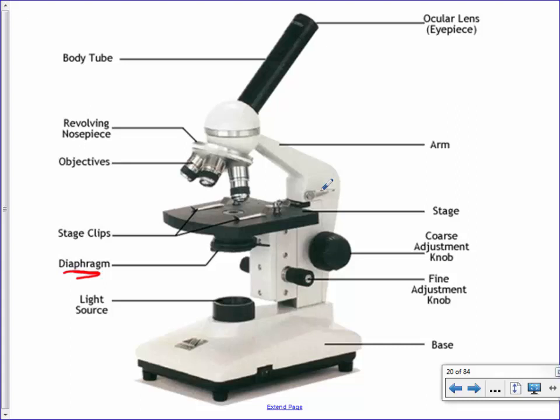If you want to figure out how much zoom a microscope has, you have to take the power of the ocular and objective lenses and multiply them by each other. In pretty much all cases, take a number and times it by 10. It just depends on which lens you're using. So either 4 by 10, 10 by 10, or 100 by 10. Does that make sense? Okay, that figures out your zoom, like how much magnification it has. But there's another term I want to talk about called field of view, and I think we need to flip to the next page for that one. So flip to the next page here.